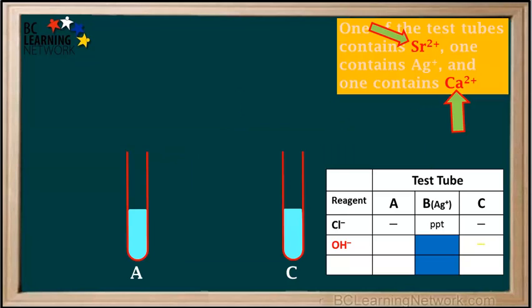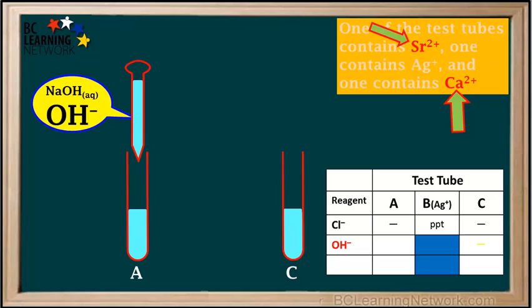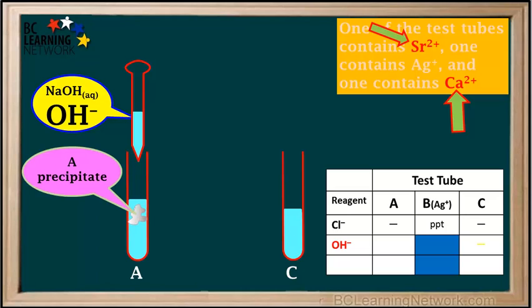We rinse out test tubes A and C and refill them with the original solutions. We'll remove test tube B since we already know it contains silver ions. We fill the pipette with NaOH solution and bring it over to test tube A. We slowly add NaOH to test tube A and observe that OH- formed a precipitate. So we'll write PPT in the cell for hydroxide in test tube A.